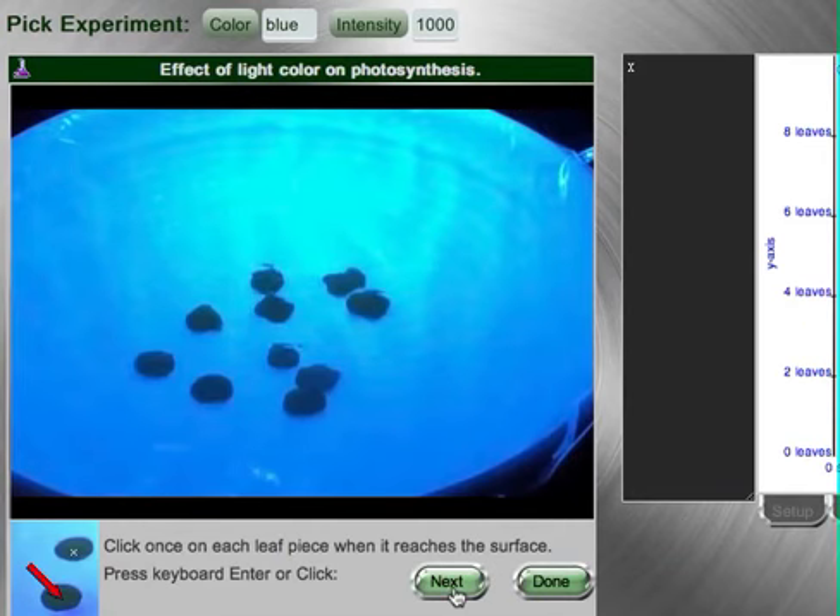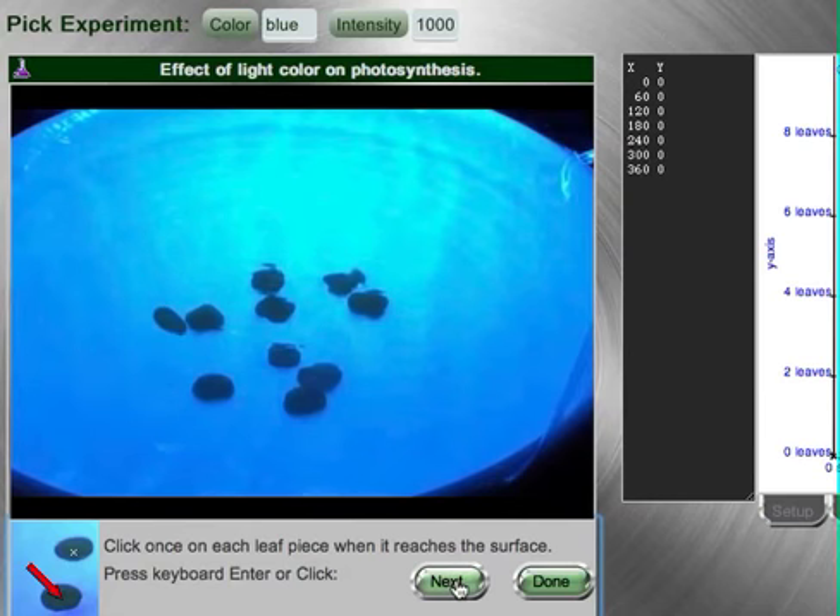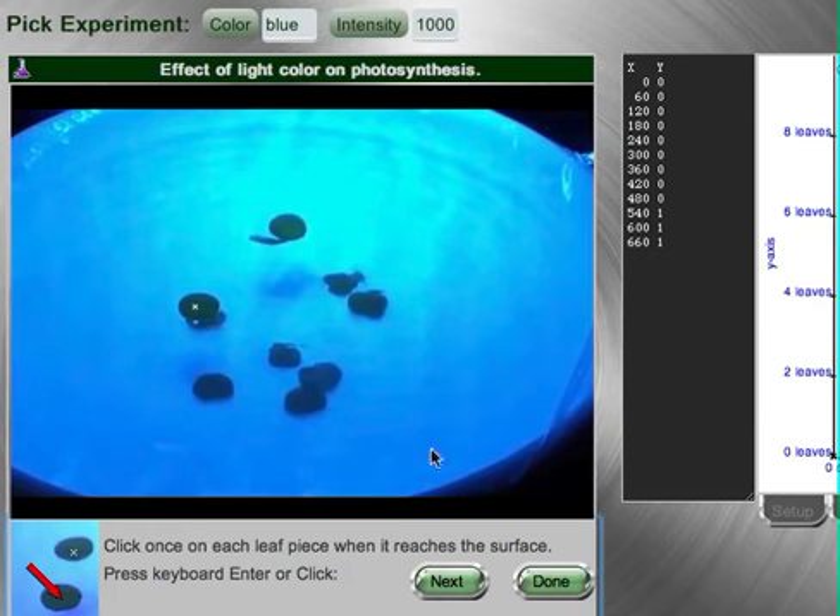Just click on the leaf when it reaches the surface. If you see none move, press the next button and time will pass. There I see a disk that has reached the top, so I will click on it. There we go.